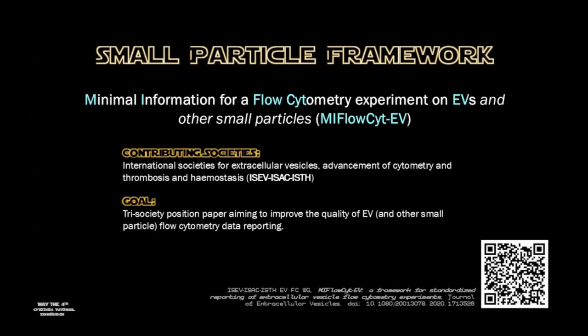Some EV samples were sent between all of the sites, and then the data was aggregated. And we realized that none of the data was concordant, and we didn't really know what we were looking at. And what we ended up having to do to really understand how each of us was using our flow cytometers for EV analysis is to construct a reporting framework so that we knew how to replicate one another's results. And the result of this is MIFlowCyt-EV.